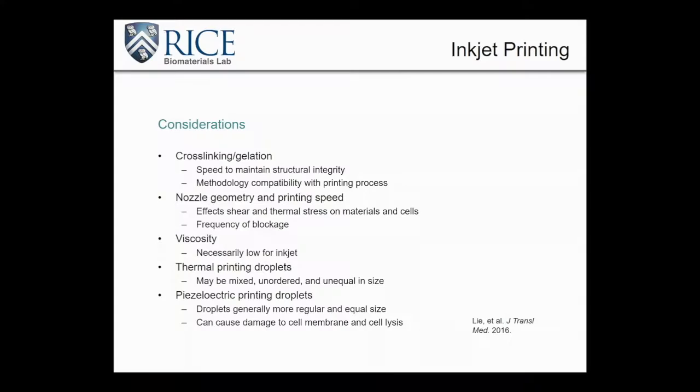With thermal printing, we can produce droplets with relatively good cellular viability, and that process has been around, it's one of the processes that has been around the longest in 3D printing, so it's fairly well understood. But even with our understanding of thermal inkjet printing, you often get mixed, unordered, or unequal in size droplets, which can drastically affect the resolution of your 3D printed scaffold, as well as even the viability of the cells long term.